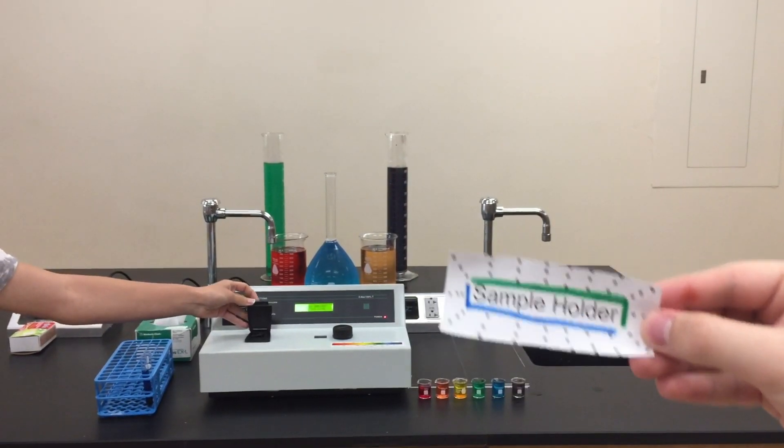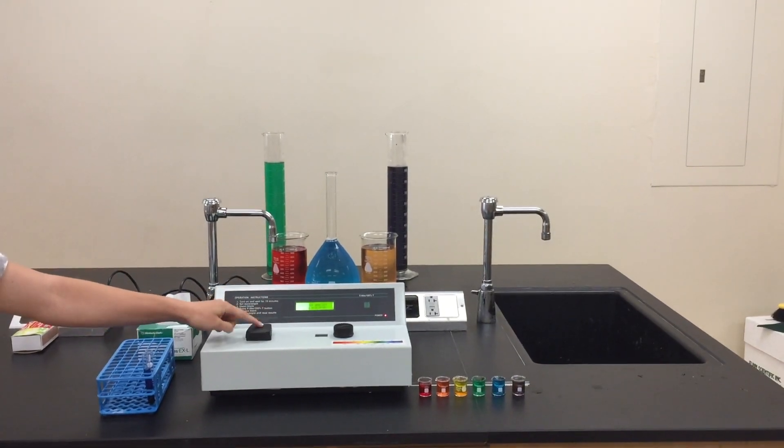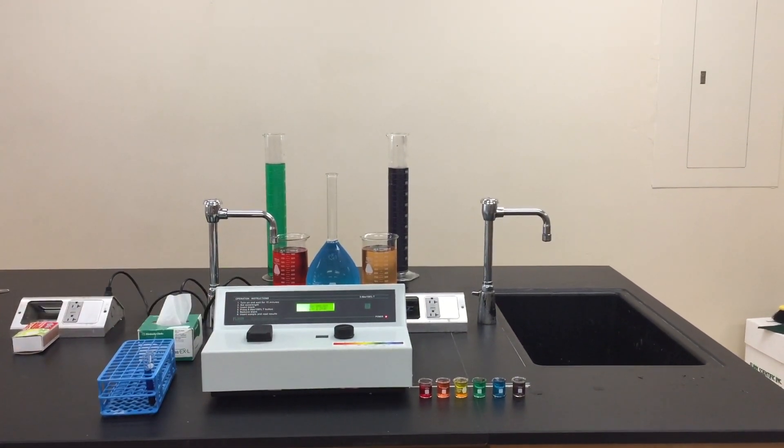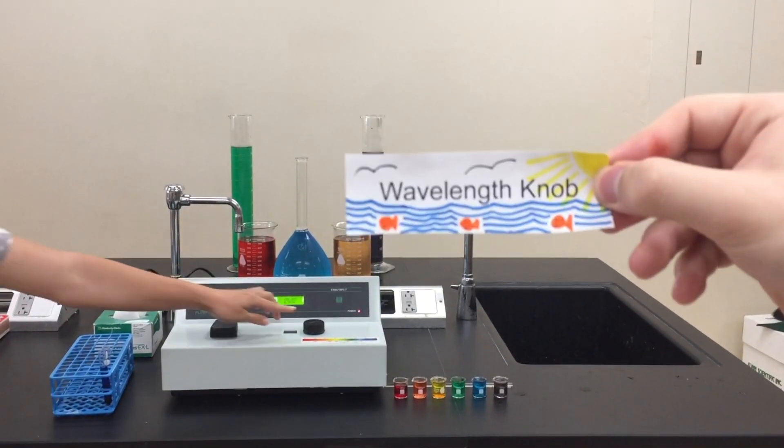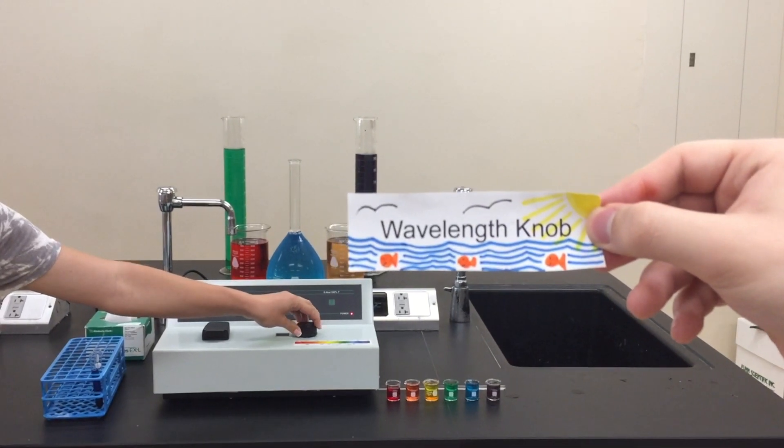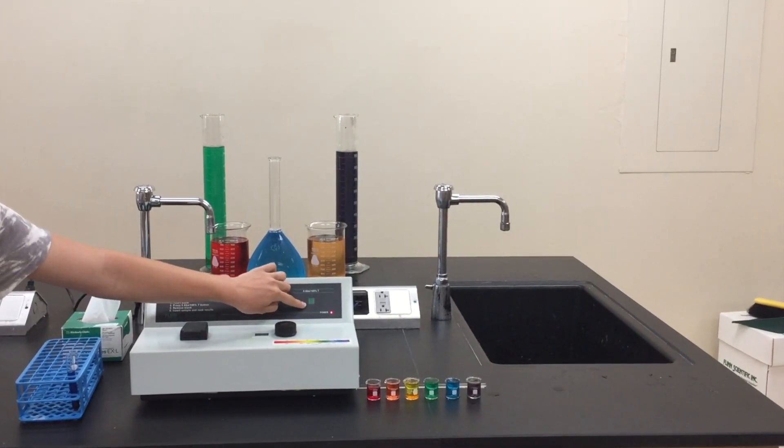This is the display where the values will be shown. This is the wavelength knob; it adjusts the wavelength of the light that will be sent through the solution. Lastly, this is the calibration button, which is used when blanking the machine to ensure the accuracy of the measurements.